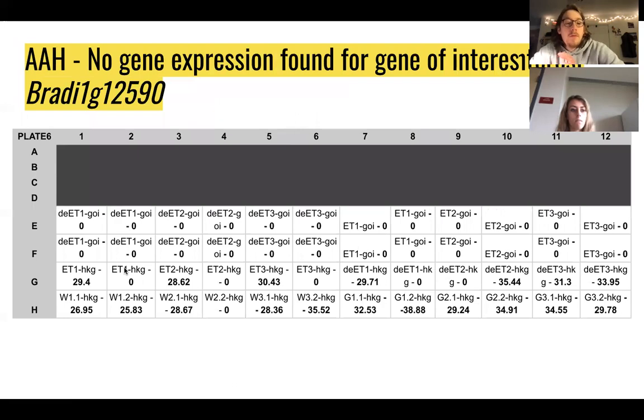Next, we used reverse transcription to make cDNA from our RNA samples. We attempted to quantify our cDNA with qPCR and compare the expression levels to that of housekeeping genes, but our experiment was unsuccessful.